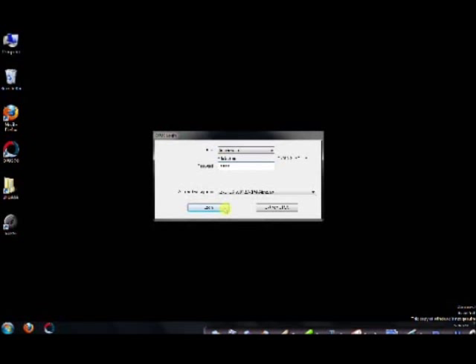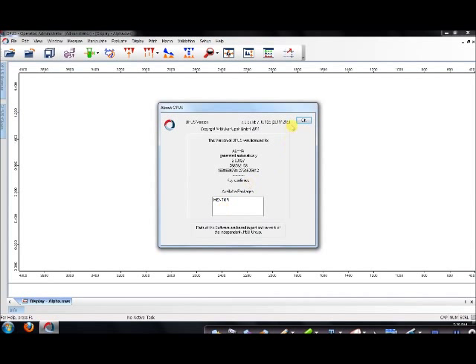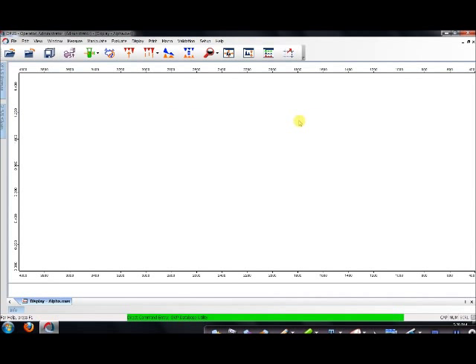Once you're in the program, you're going to check the status of the light at the bottom right-hand corner. It should be green.